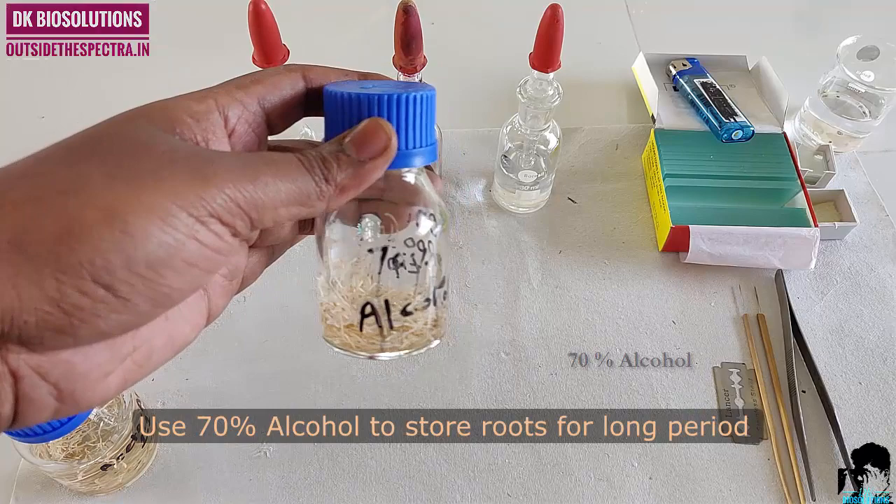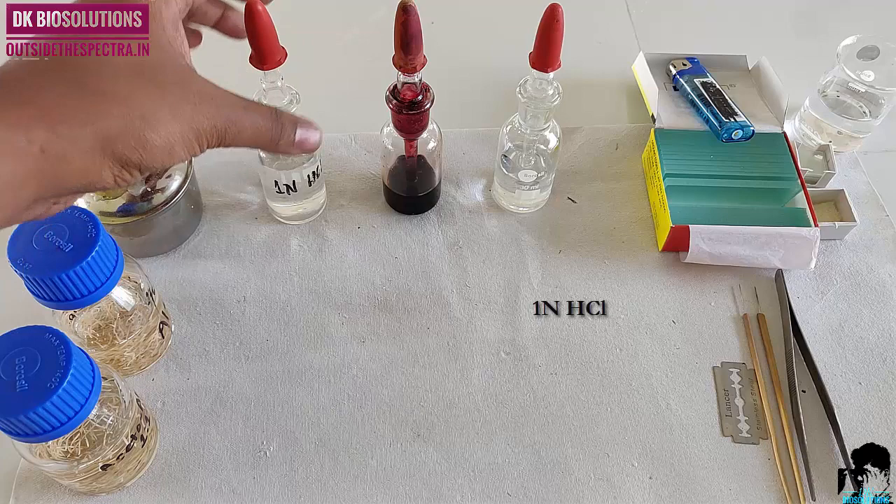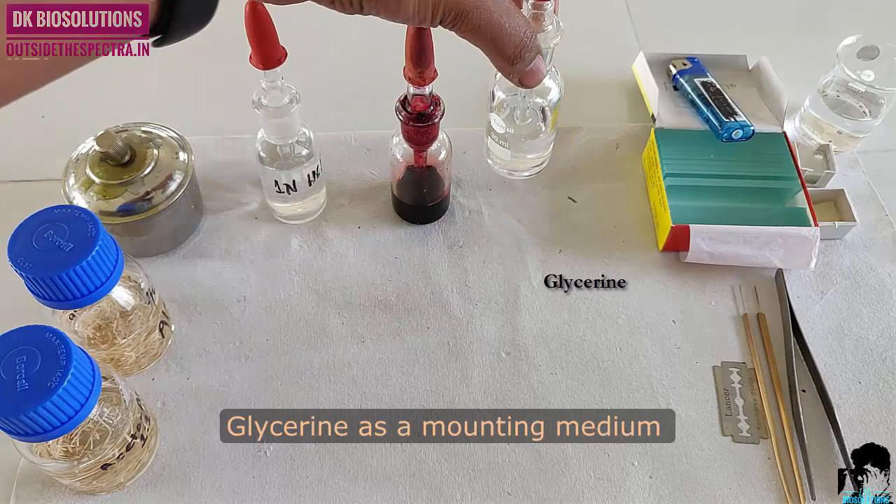Then we need a spirit lamp to warm our slide at the time of staining. One normal HCl for tip hydrolysis. Aceto-carmine stain to stain the nucleus and chromosomes. Glycerin as a mounting medium.